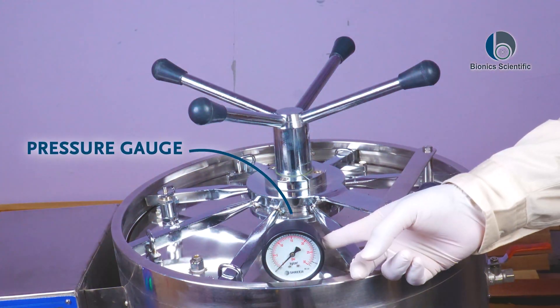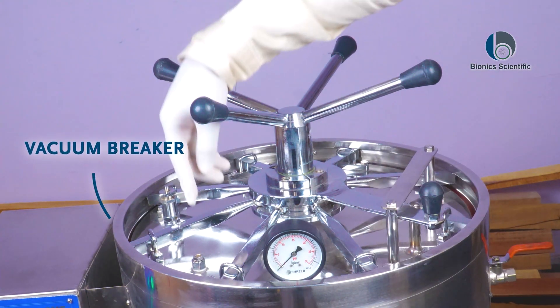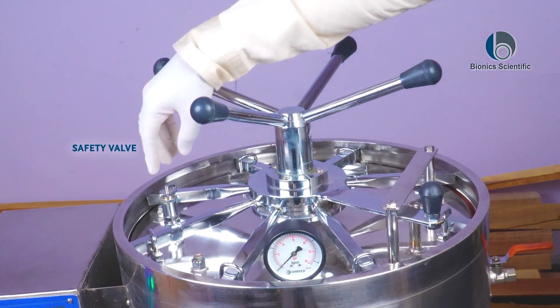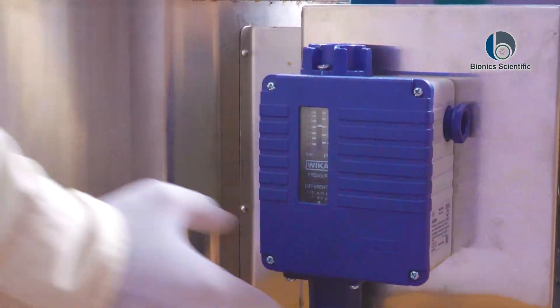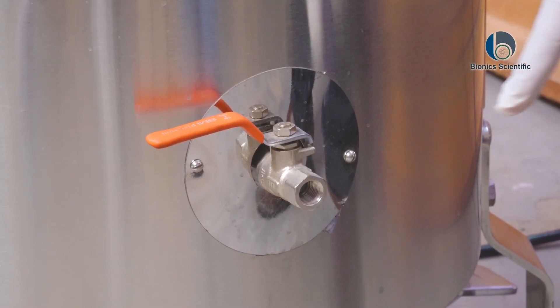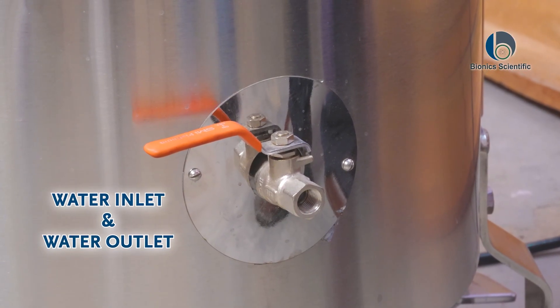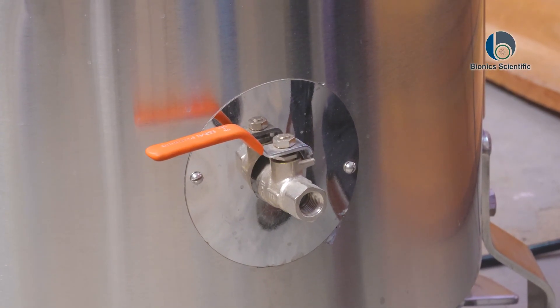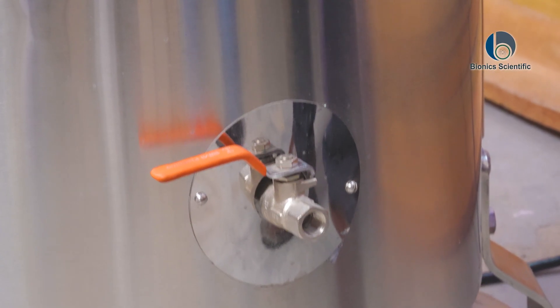Here is our pressure gauge, which will show you the exact pressure happening inside the machine. This is our vacuum breaker, and this is our safety valve. Behind the autoclave there is also a form of pressure gauge. This valve here is for the water inlet and outlet for the autoclave.